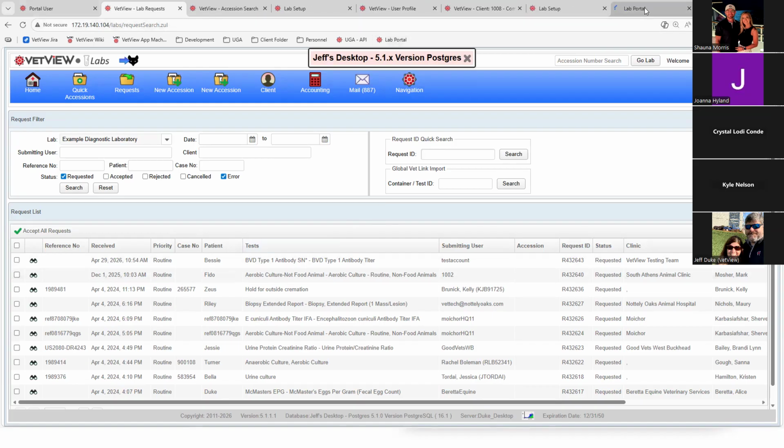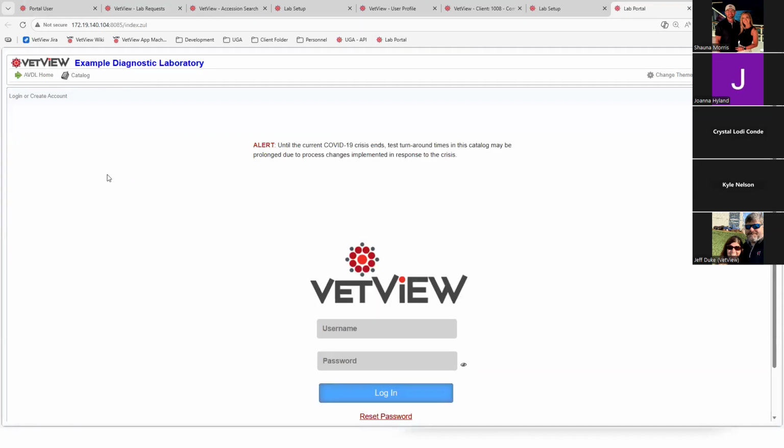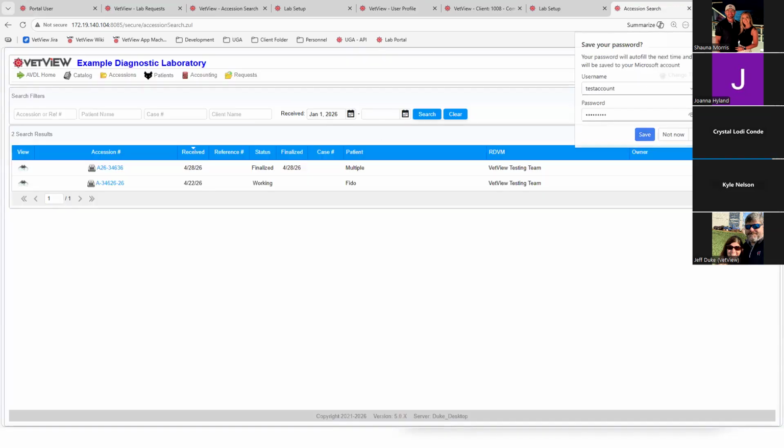Let's go through our portal first. So this is one of our test portals I've got set up here. Again, each user would have their own username and password there. So I've got my just test account here and I log in. So this is our basic portal.